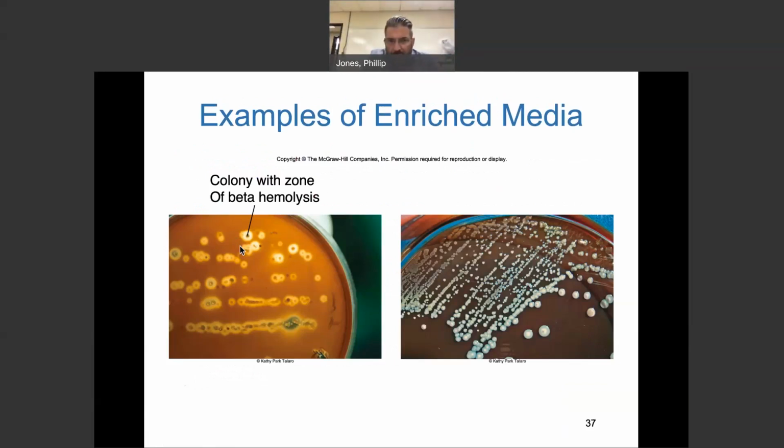That's what it should look like, very similar to that color. But depending on what's growing, if it hemolyzes, hemolysis, so hemoglobin lysis, if it lyses that red blood cell and consumes it, it will be clear. So when you're in the lab, we've got some halogen bulbs I put in the lamps here. You can just look and see if it's partial or fully alpha or beta hemolysis.